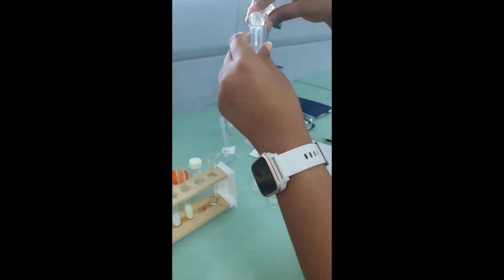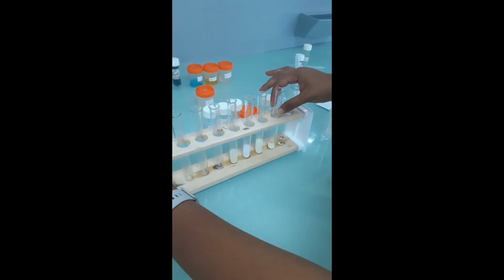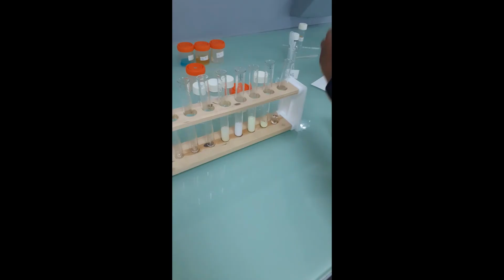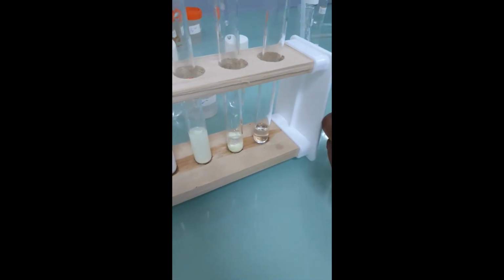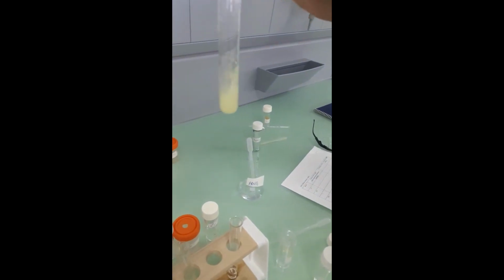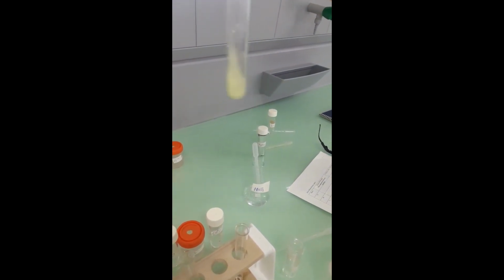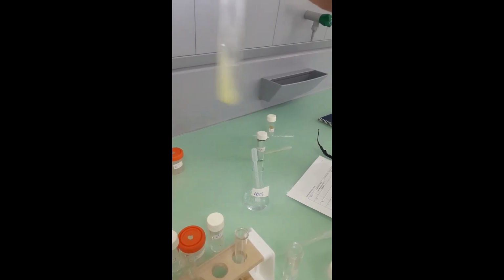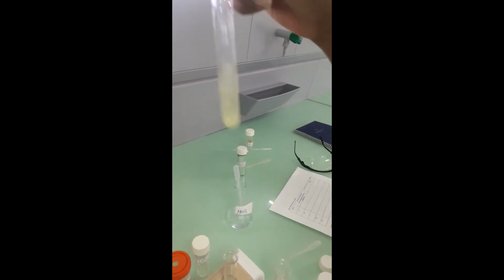Now we're going to divide the bromide into two. And we're going to add ammonia to one part. Yes, and then we'll add nitric acid to the other part.